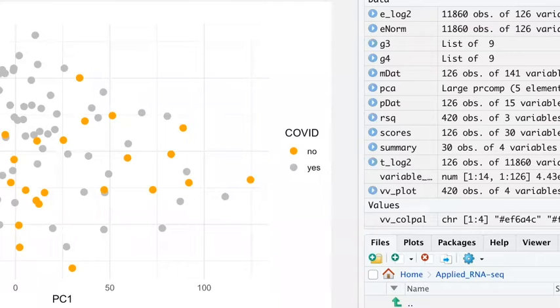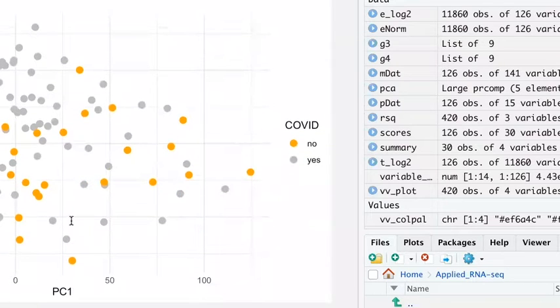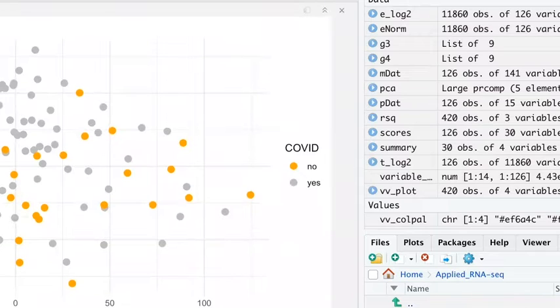Now, one thing that has again been taught to me by a previous lab member, Dr. Julia Del Gobo, who's now in Ontario, is that when we look at this, you'll see that the y-axis and the x-axis are actually different. At either end, you can see that maybe it goes up to 150 positive, but only negative 100. And when you see this, you think that this is the distribution of the data, but it's not represented in the correct axis. And because of that, you might have a different interpretation of the data than what it might be.